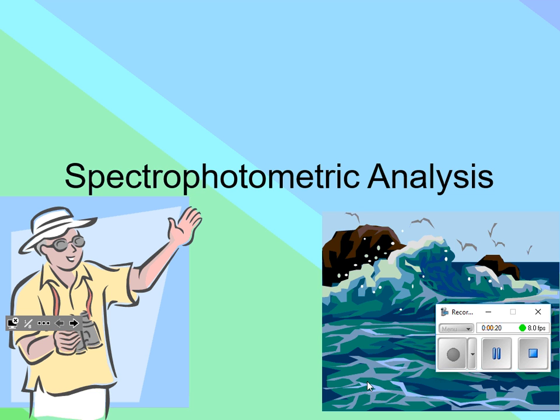So they might have you do a dilution math problem and then talk about, hey, they got bad results. Sources of error are always a big thing for AP. And so explain why this student got a bad result, referencing the equipment that they used. So that's why we're going to go over this a little bit.